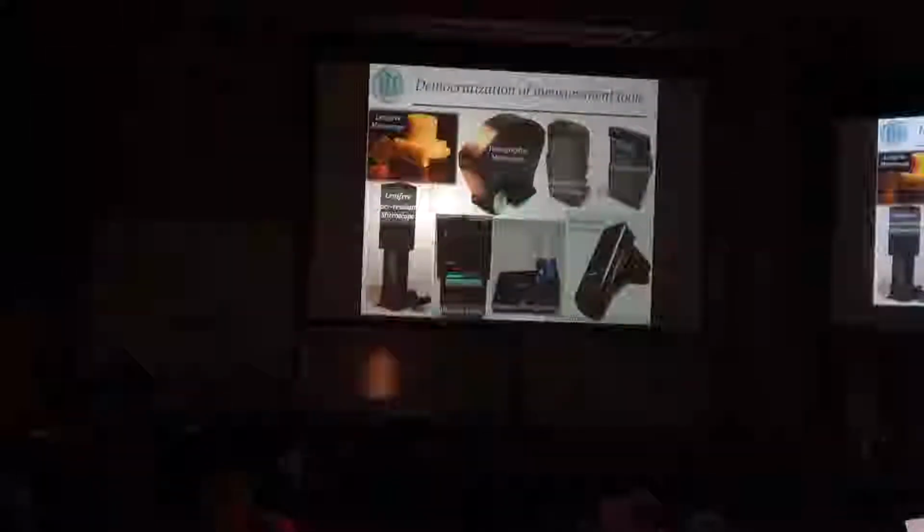So in a nutshell, my lab is aiming to democratize measurement tools, advanced measurement tools. And in this slide, I'm sharing with you some examples of how we've been utilizing computation and optics to create mobile, cost-effective interfaces to conduct advanced microscopic imaging of specimen and sensing. These are the results of a long journey.